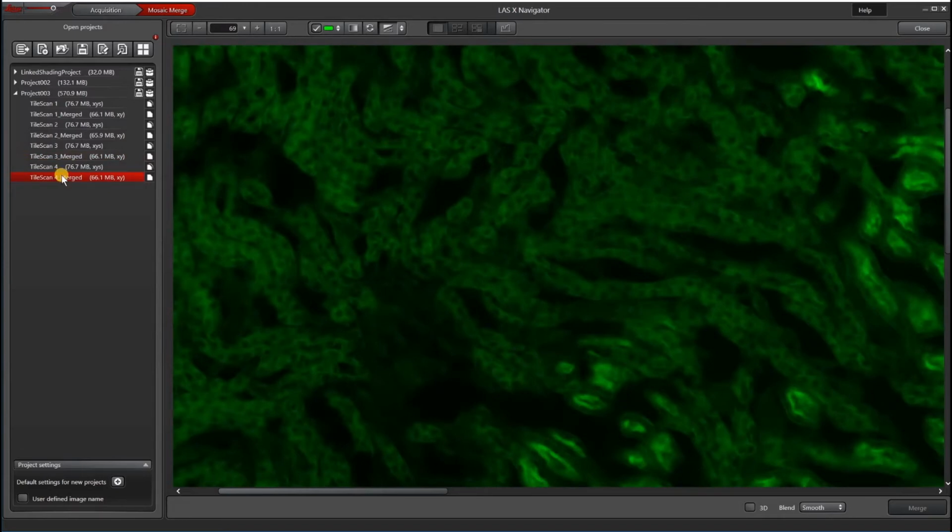So if you're having issues getting an in-focus image with AFC, make sure that your objective is compatible and that your sample is clean and flat, and that the AFC position is holding green the whole time you're imaging. It always helps to have high quality imaging chambers. Even if you're using plastic, there is optical grade plastic that is more consistent in thickness that will help with the AFC. As always, if you're having issues, please consult with your local friendly imaging specialist.